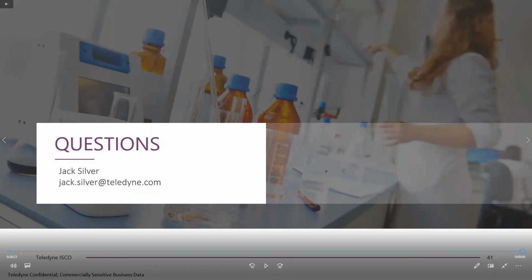So if you have, say, a Waters and an Agilent, I've got the calibration parameters for the scouting run for each of those on the side of my AccuPrep. And so whichever one I run, I then can enter that information in the AccuPrep and then calculate a gradient no matter where it came from.